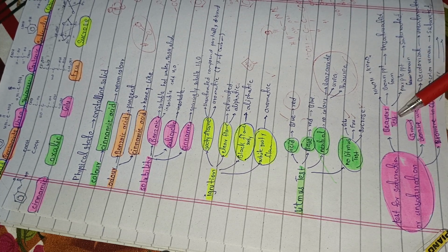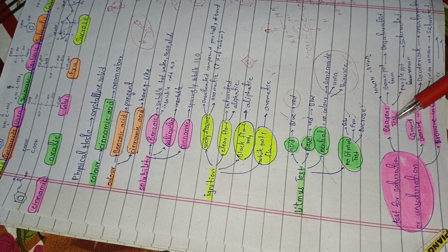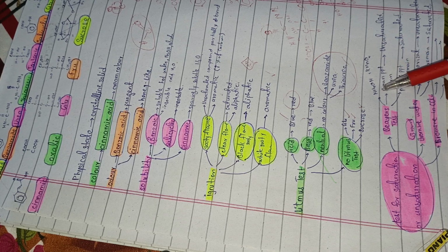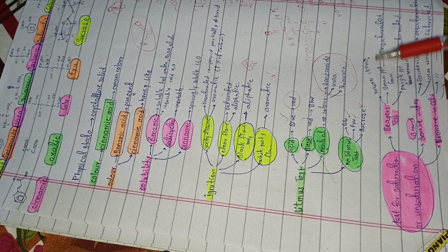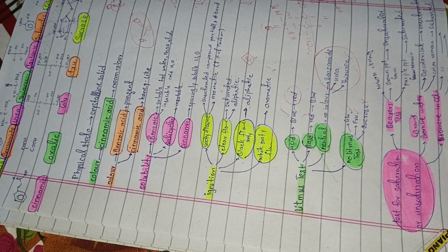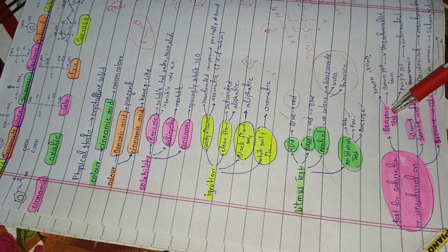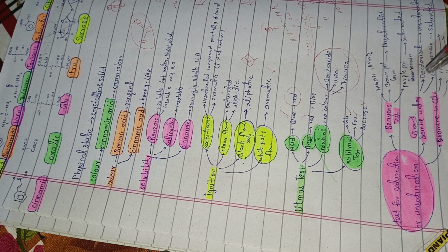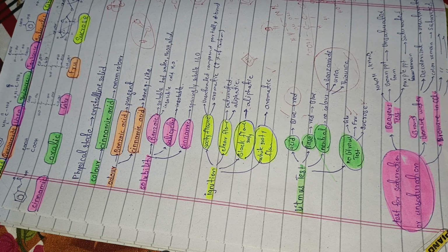First, if you are going to perform the Bayer test, you have to prepare the Bayer reagent. For the preparation of Bayer reagent, you will use ammonium hydroxide and KMnO4. By mixing both of these, you produce your reagent. After preparing the reagent, you add the particular compound to it, mix them, heat them for 5 to 10 minutes, and then cool them under tap water.